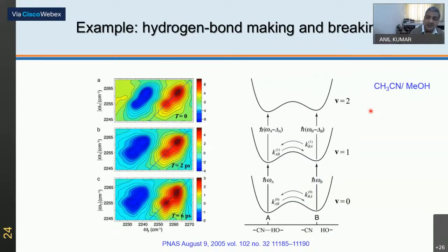Among different complex molecules, if you focus on hydrogen bonding interaction alone, can we differentiate among them? Can we distinguish between them and tell that, yes, it could be like this under certain fixed conditions of experiment? Can you just repeat the question once more, please? The question was, you have taken the case of myoglobin. Suppose I take another protein, and by focusing on the dynamics of the hydrogen bonding interaction, can we differentiate among these different proteins or complex molecules?